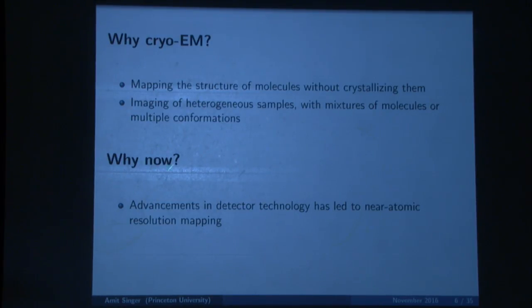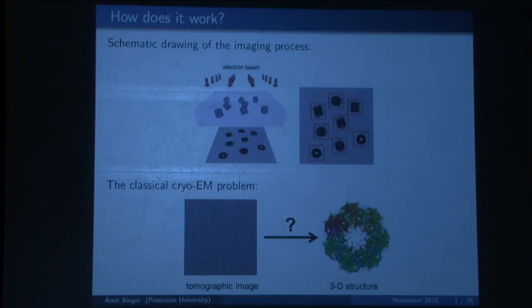Not just one structure, like you get in a crystal. And you can also ask, okay, so why now? Why this sudden flourishing in the area of cryo-EM? It's really a technological advance. There's been a major improvement in detector technology that allows us to get to much higher resolution. I will not talk about this technology here today.